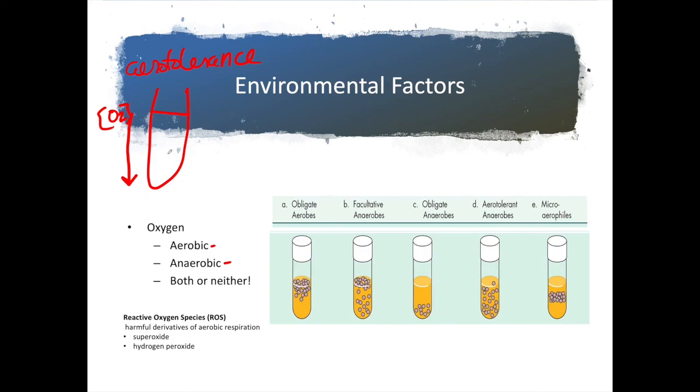I then take bacteria that's growing in a liquid culture, and I inject some of that bacteria into this liquid agar. I spin the tube around to stir the bacteria so that it's moving around within all areas of the tube. I then immerse the tube in an ice bath. Now the agar will solidify very quickly, trapping bacteria in all of the different oxygen environments within the tube.